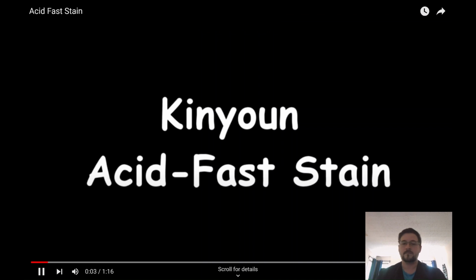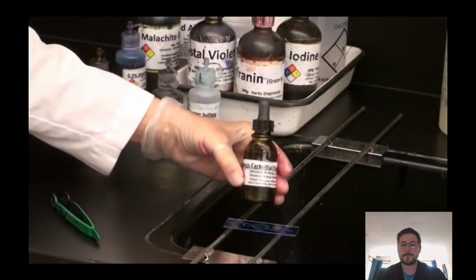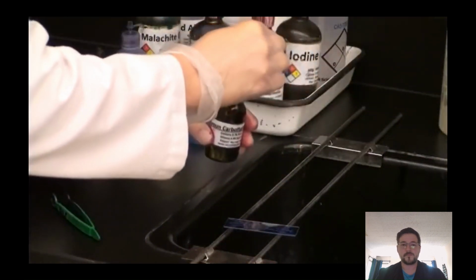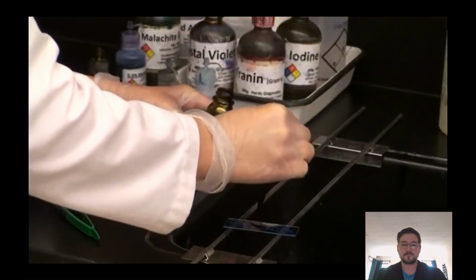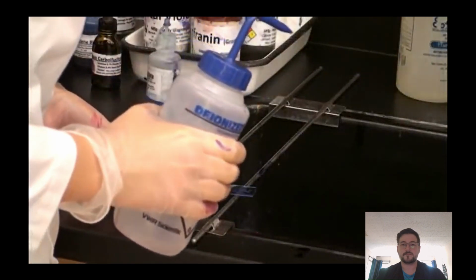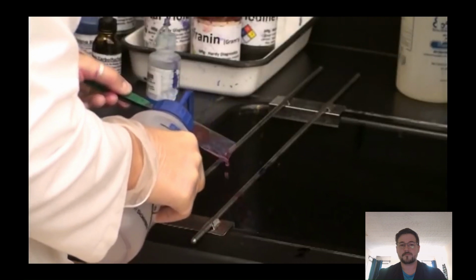Before beginning the acid-fast stain, hard heat fix your smear. Begin the acid-fast stain by flooding the slide with carbolfuchsin. Let it sit for 5 minutes. Rinse the slide with deionized water and shake off the excess water.